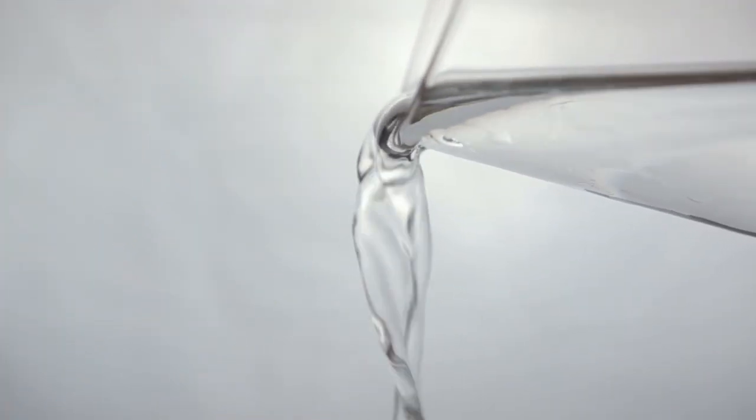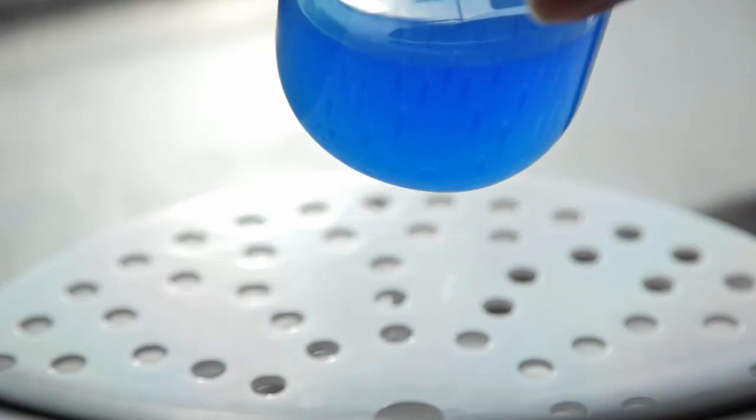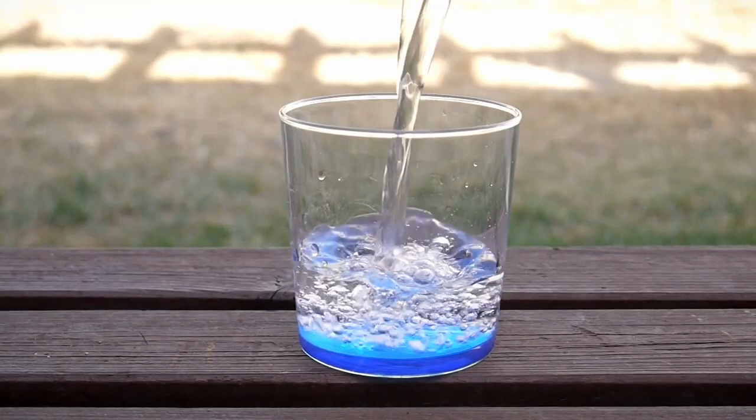If your test samples are aqueous solutions that don't contain any solvents — like drinking water, surface water, culture medium, or lotion — then you can use the simplest general vacuum pumps. The easiest way to tell is if you dare touching the samples with your bare hands.